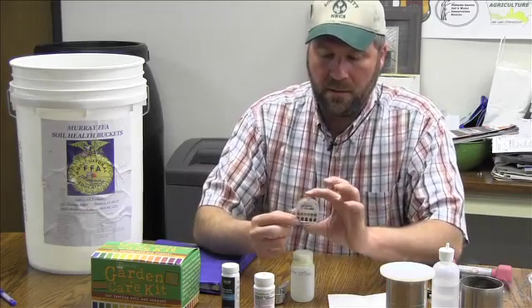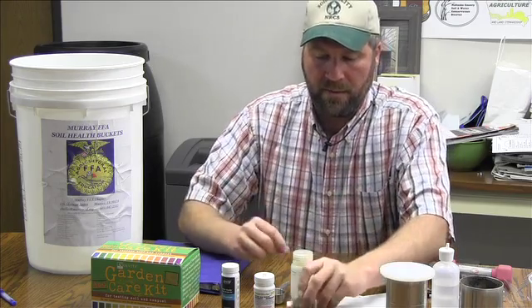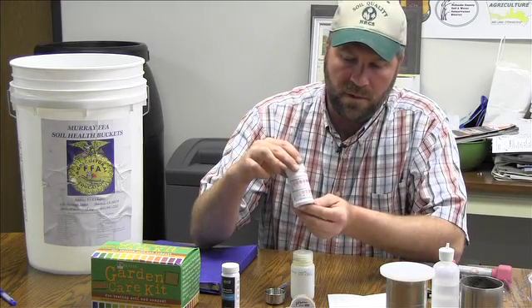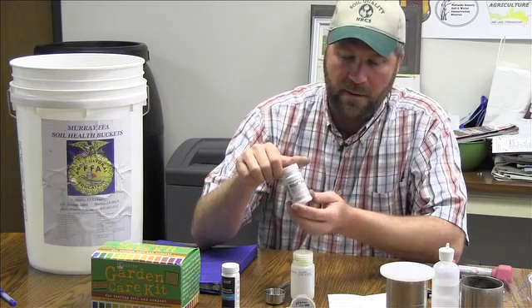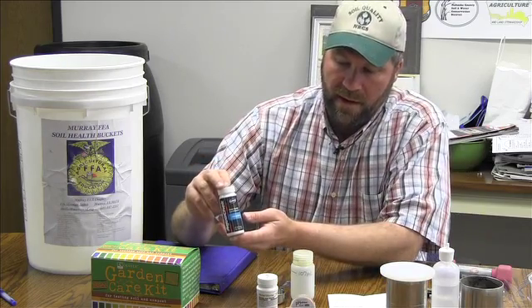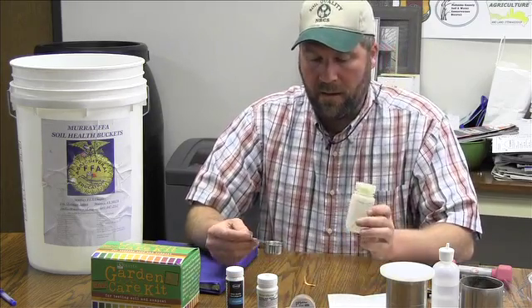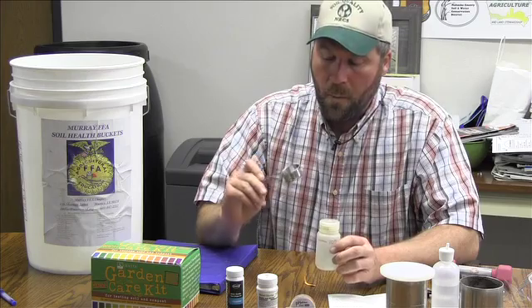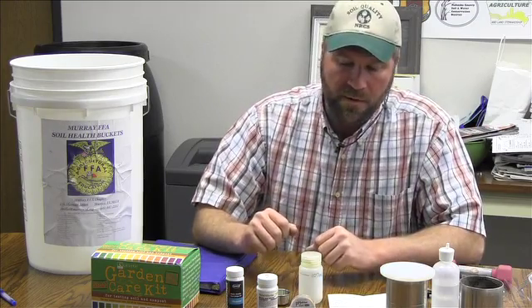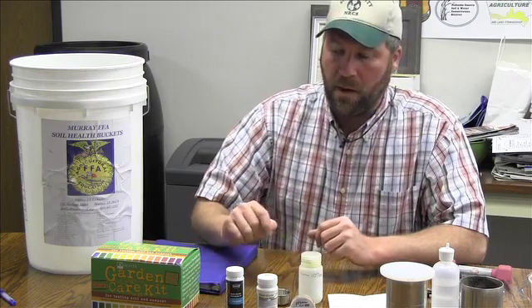Here is the pH ribbon. You just pull this out and take a strip off to do your pH sample. The nitrate bottle has two pink sides on the back — it says nitrate and nitrite, but we concentrate on the nitrate in the field. The other chemical property test is the phosphate test. We mix a one to one water to soil ratio, mix that up for one to two minutes, and that's how we get our sample homogenized so we can do these tests more accurately in the field.